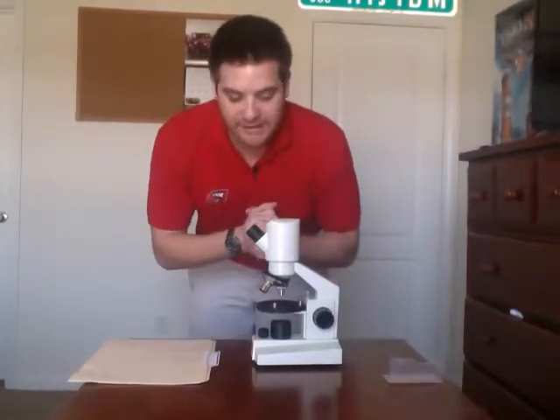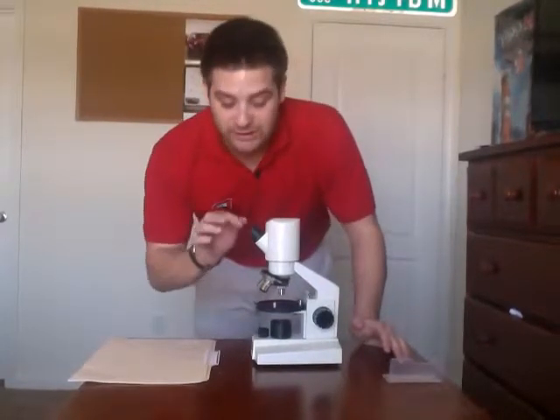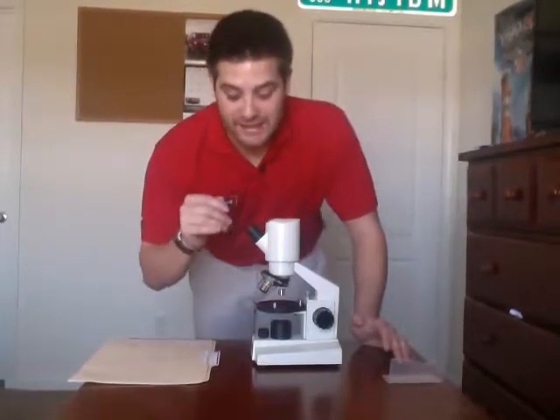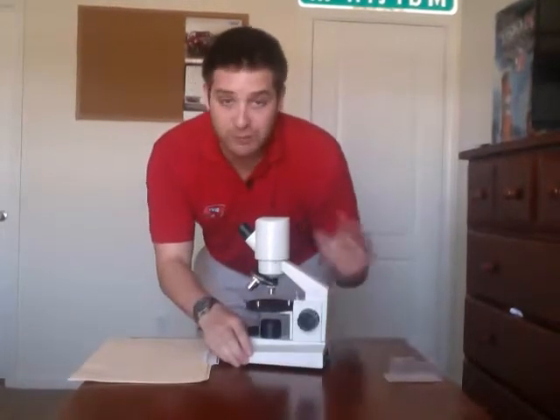Okay, and another thing, do not touch the lenses. Don't stick your finger directly on the objective lenses, because they're very sensitive. But if they are dirty, raise your hand and somebody will come over to assist you, and we will wipe it with a special type of cloth. So remember, don't ever touch the lenses with your fingers, because your fingers have oil and stuff on them.